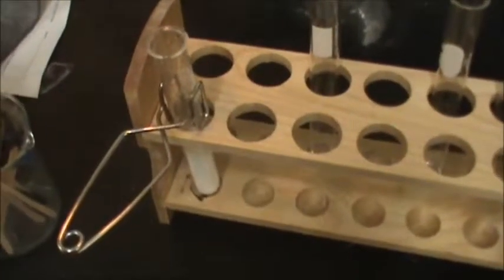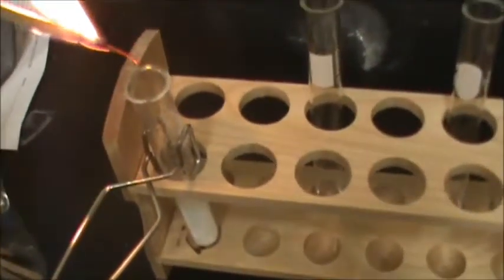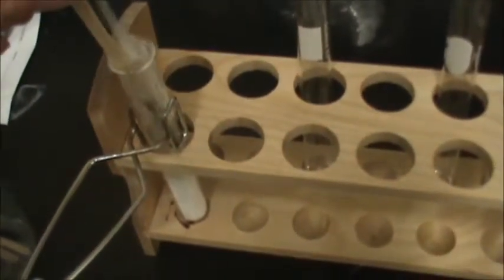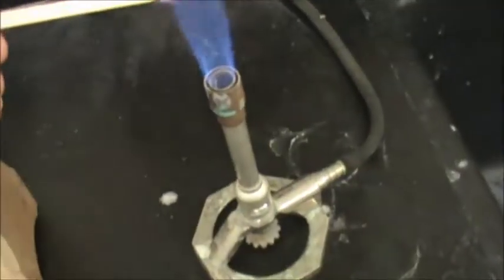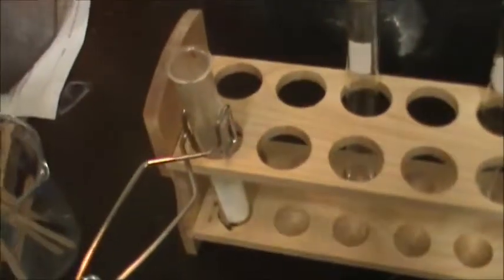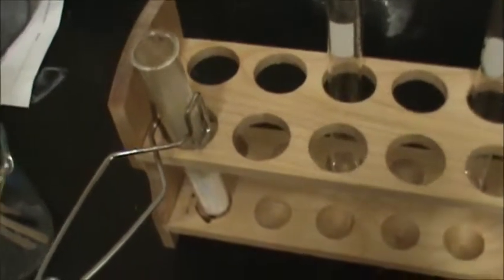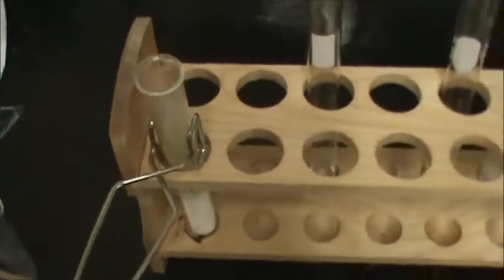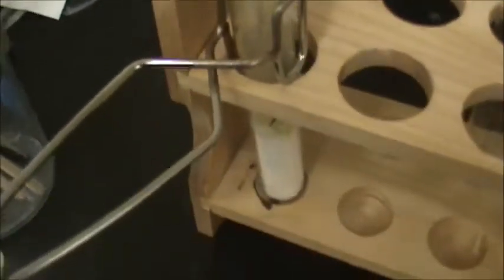Let's zoom out. Let's test that thing out. Last thing, let's test out to see what happens here if I take a lit splint and put it into this test tube. So watch closely as I put it in. It puts it right out. What the heck is that? A gas that is being produced from this heating of this white powder is having no problem putting that flame out. What could that possibly be? Can you think about it? Out of the 3 gases that you were talking about in your pre-lab, what are the gases that must be coming out of sodium hydrogen carbonate?